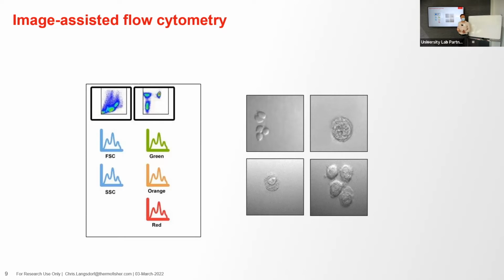And sometimes that's really valuable because you might have a confusing result here, and you can say with the image, that's confusing because it's not one cell, it's 4 cells that were stuck together. And that's why it's positive for markers that shouldn't be co-positive. It's because I have a lot of cells that it identified as one cell, right? And for very small things, this might be especially interesting for bacteria or exosomes.